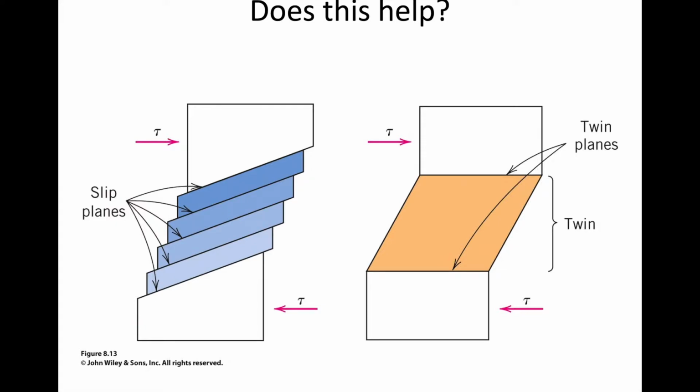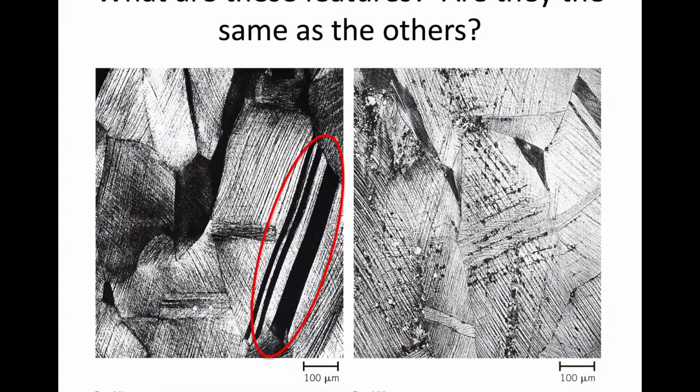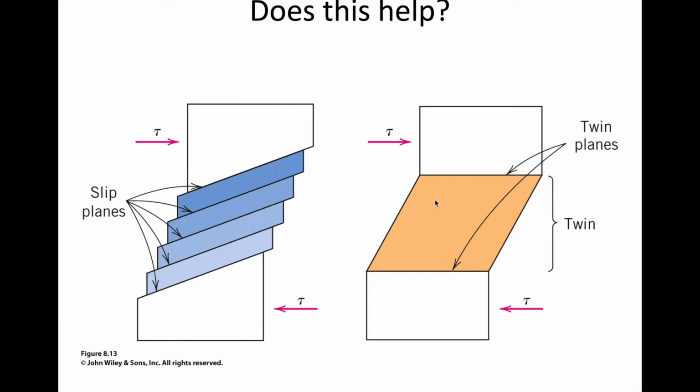It can also occur from annealing, but these are when you change the orientation of a subsection, the twin, and then it goes back to normal. And so the contrast on this, because of the etching rate or the way that it scatters light, is different, and that's why you see the difference in contrast here, because of the etching rate and the fact that a different plane is exposed, right? And so that's a thick band when it's what we call annealing twins.